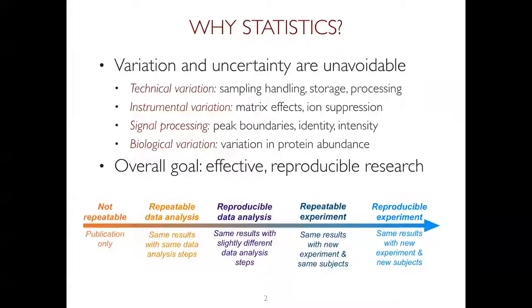So what I also like to do now is to emphasize that when we talk about reproducible research, it's actually not a thing, it's a spectrum, that there is a whole continuum of reproducibility, and different tasks may be held to different reproducibility standards. And so on one side of the spectrum, we have research which is publication only, which is not good, and unfortunately it happens much more than we would like, right? So our goal is to move away from that.